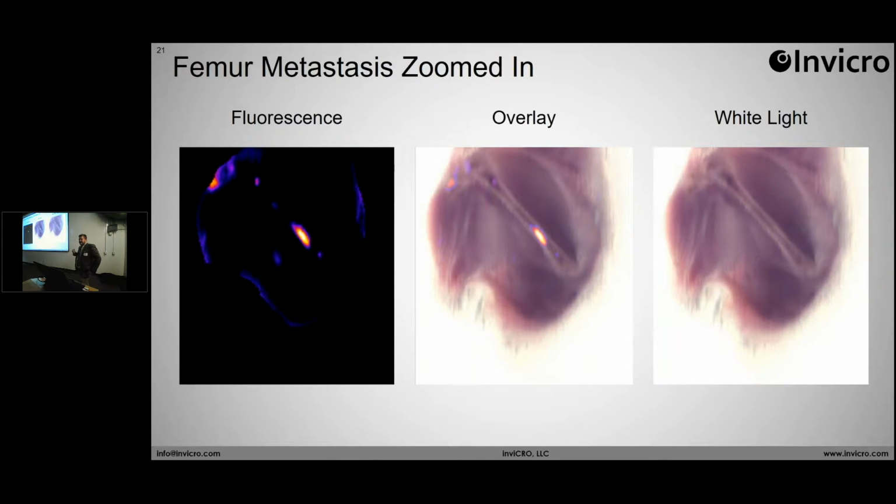This is a high-resolution example specifically from a tumor metastasis in the femur. This is the sort of thing that is very, very difficult to see in many other imaging modalities, even in something like histology. But if you have a supercellular resolution imaging assay, you get a 3D view, and then you can comb through it later.